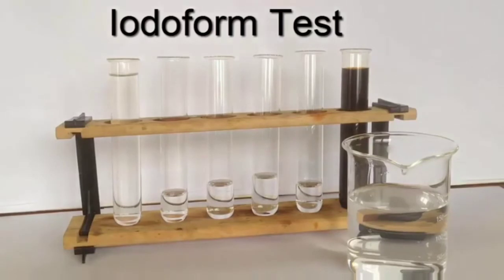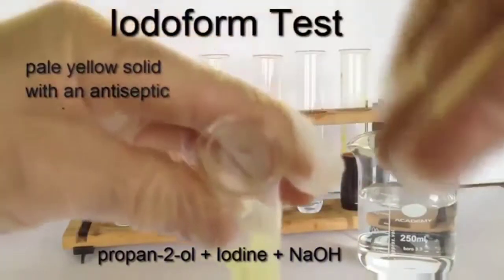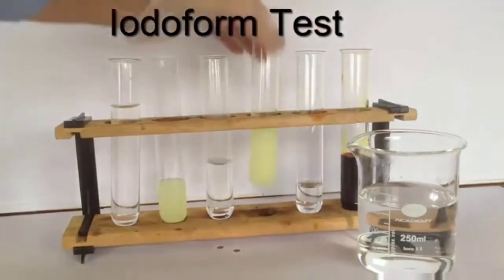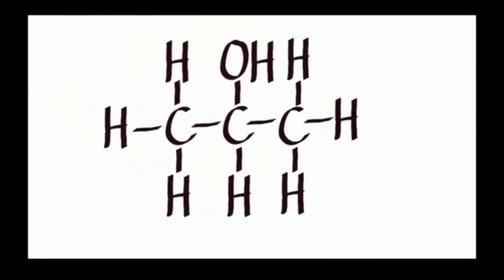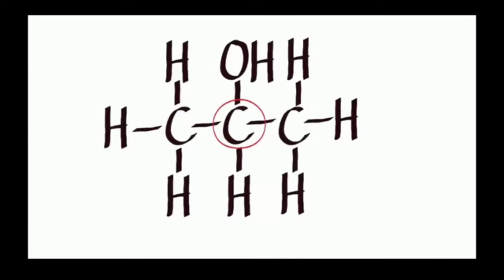If we have an alcohol with that particular type of grouping, we get iodoform. Pale yellow precipitate. I'm wafting the fumes towards my nose there, picking up the antiseptic smell. So why does propan-2-ol give a positive test? Let's look at the structure of propan-2-ol. There it is. The OH is on the inside carbon. And does that inside carbon have attached to it both a H and a methyl group? Well, there's the H. And in fact, it has a methyl group either side.